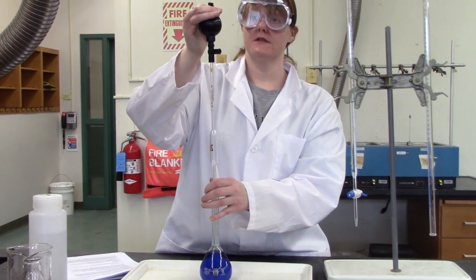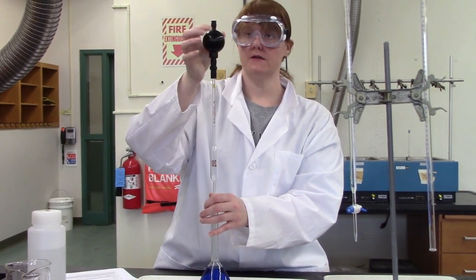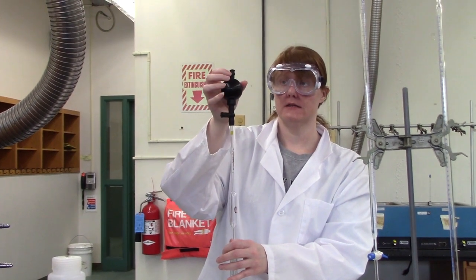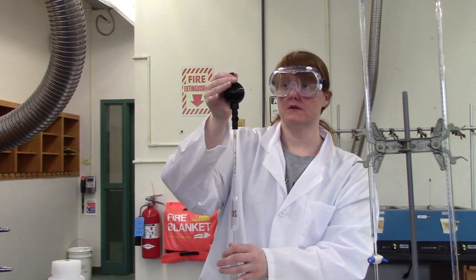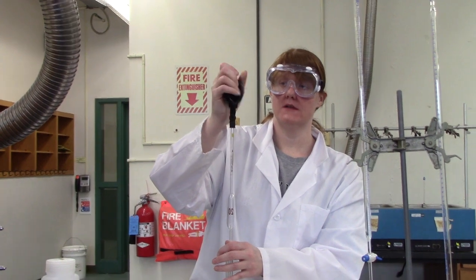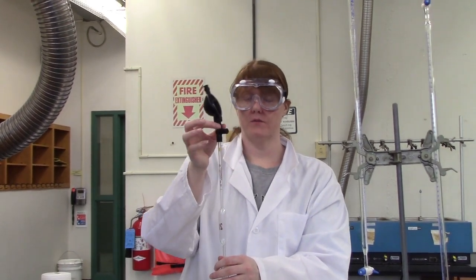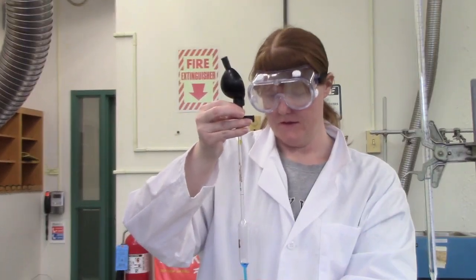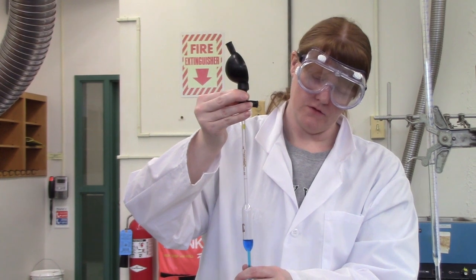The first thing to do is it's going to come to you with the bulb inflated. So you squeeze A, which stands for aspirate. This is the A button up here. So you squeeze A, and then squeeze the bulb to eject the air. And then I'm going to push S, which I think stands for suck. I don't know what else they would call it. And that's going to suck up the liquid for you.